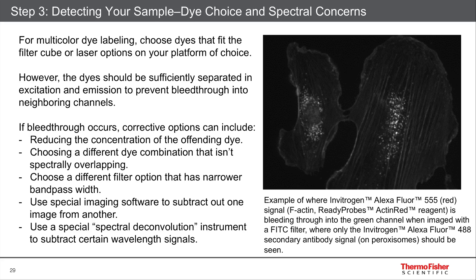Now, realize that you can sometimes have a problem with bleed-through. This is where, for example, you have a green fluorescent dye like Alexa Fluor 488 and an orange-red fluorescent dye like Alexa Fluor 555 or Cy3, and one dye bleeds through into the filter of the other dye such that you see a signal.